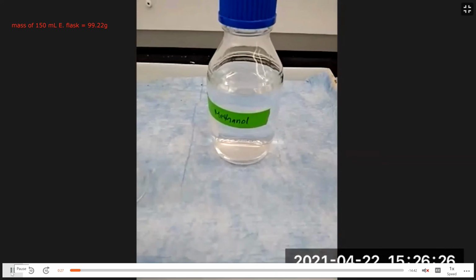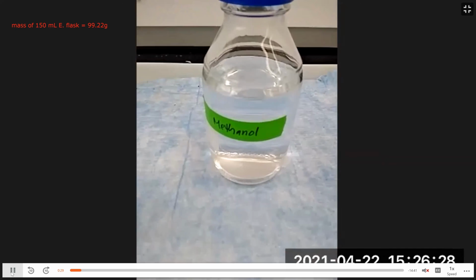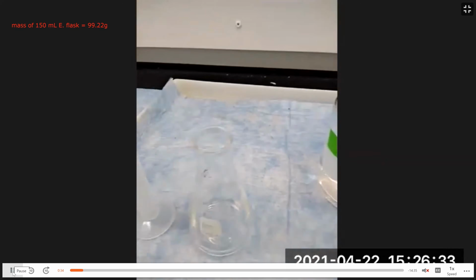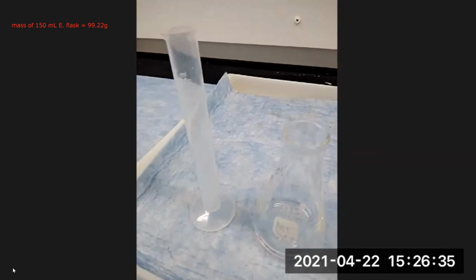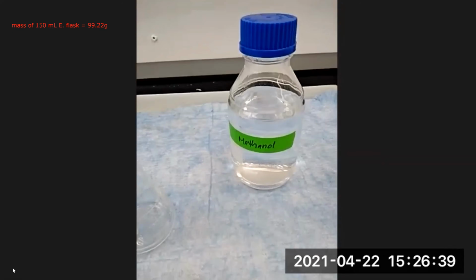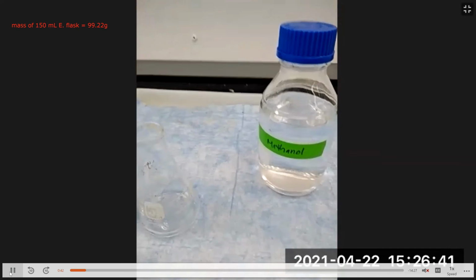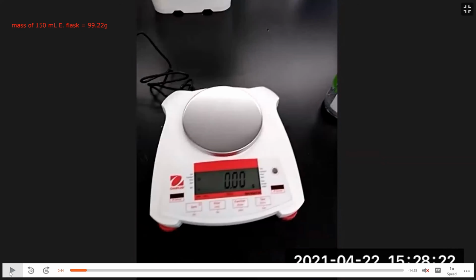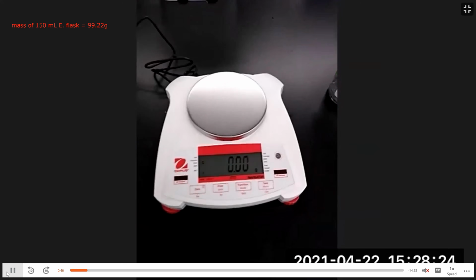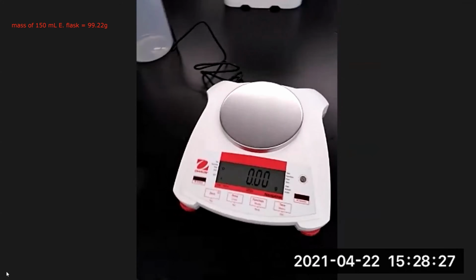Next, we're going to add methanol to the Erlenmeyer flask and then dissolve the iodine crystals. Now we're going to weigh out our iodine.